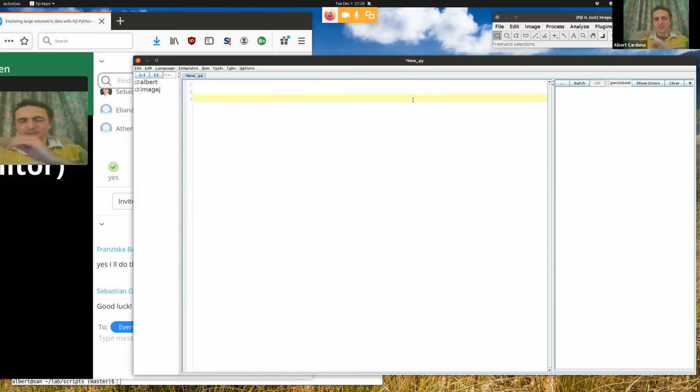For instance, most applications are built in such a way that as they execute whatever it is that they are doing, say, for instance, ImageJ is opening a file, it gives you the ability to insert some of your program into that, so that when it opens the file, it notifies your program that a file has been opened. This is very convenient because it means you can capture what's going on in the program around you. In the same way, you can do that for keystrokes, for mouse events, and for focus events, and many others.